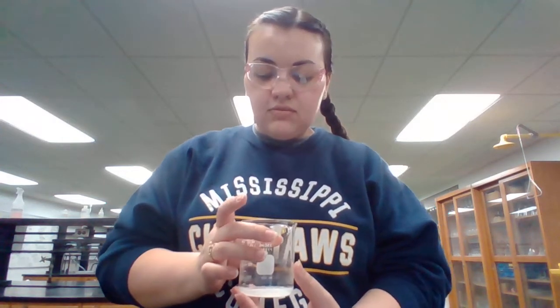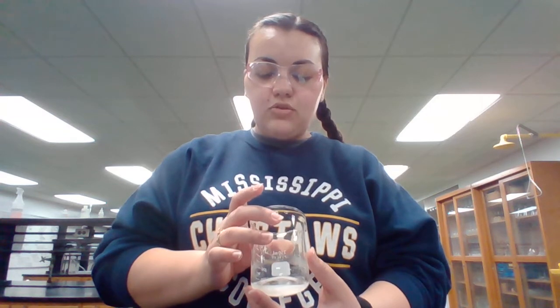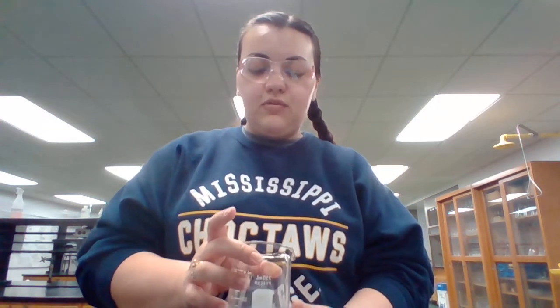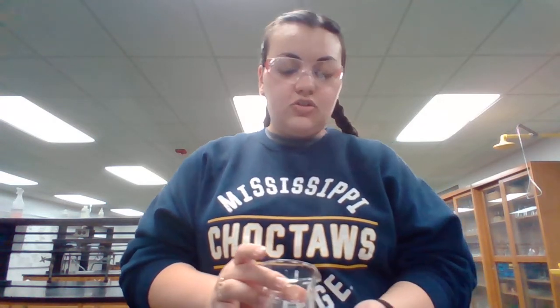It's not a large solid like y'all have been dealing with. It's very fine. It almost looks like it's a liquid moving inside itself, but it's not. It's actually a solid. It's just super, super fine. But it is white, so if it's not white when you guys do it, then there is probably a problem.